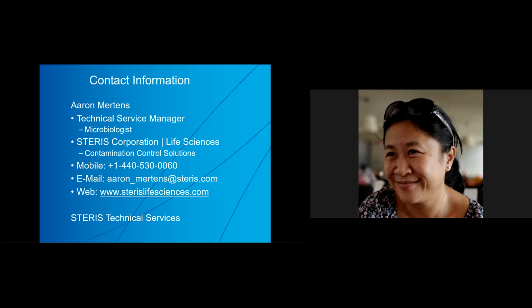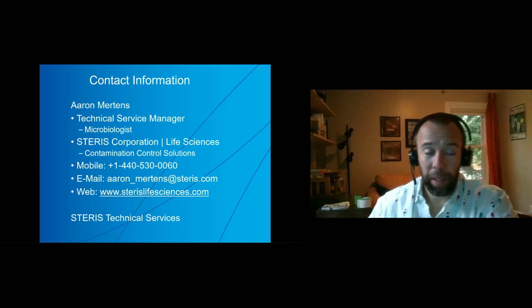So from Mahendran, he's asking, from your experience, was there ever a time equipment qualification was done within the autoclave with a specified amount of WFI within the equipment? Is it necessary? And if yes, why? The equipment in question is the main body of a glass bioreactor from my previous site. Yeah, that's a good question. And this is a very specific question.